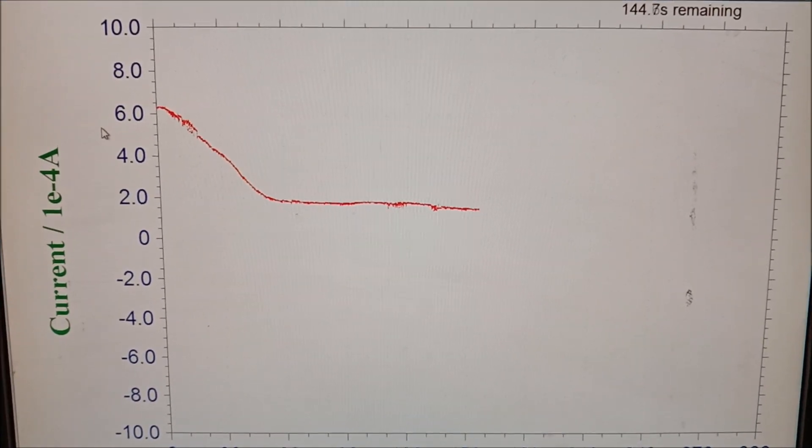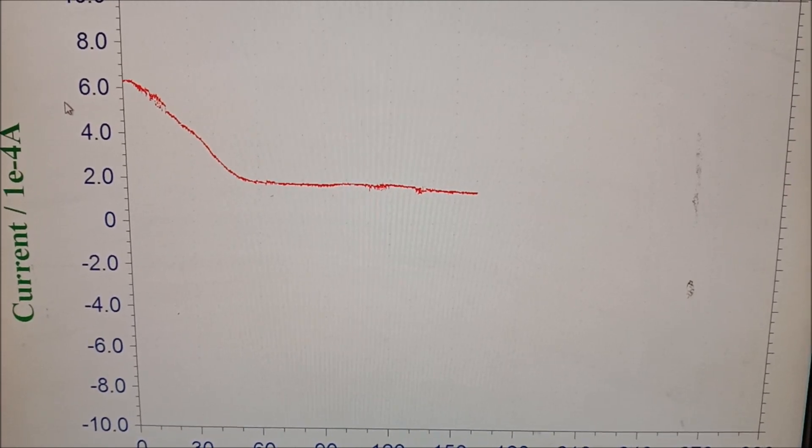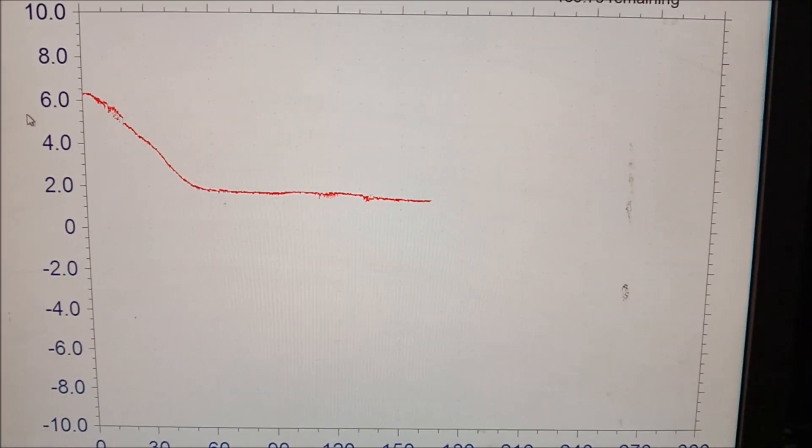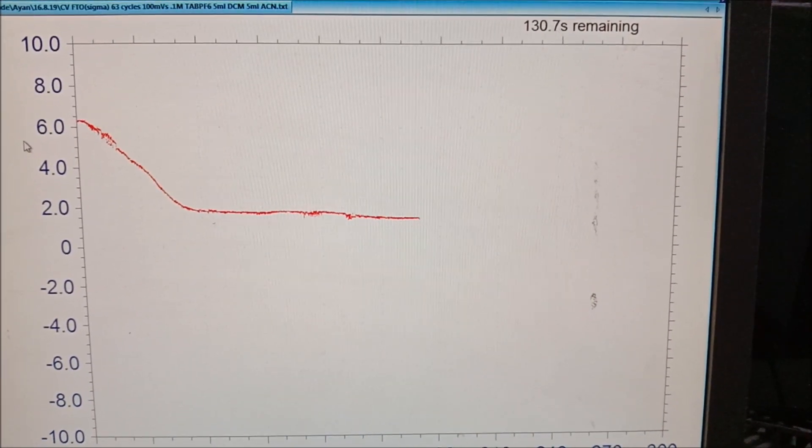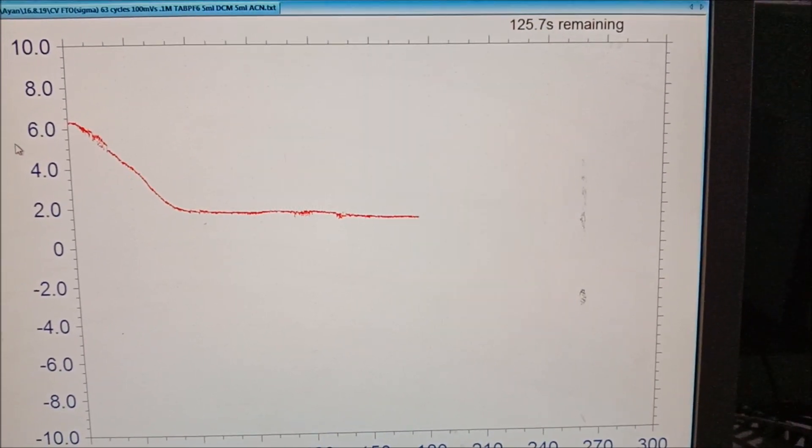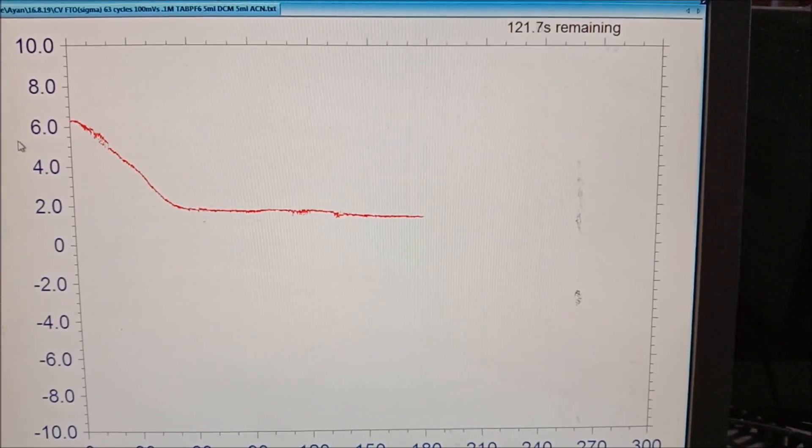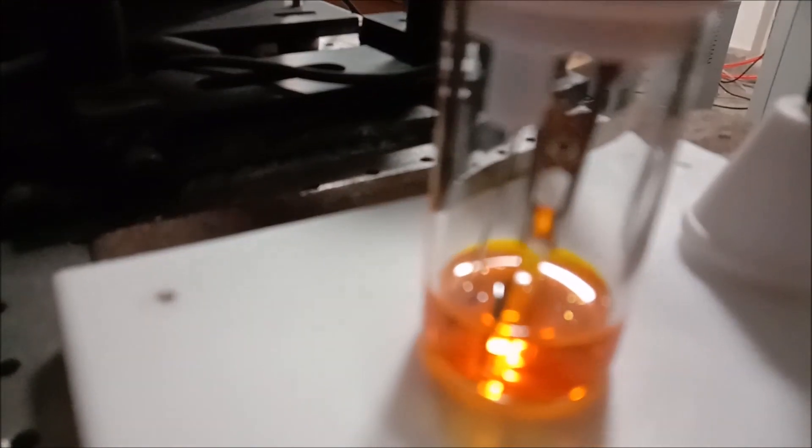I think we have got the optimal thickness in the first process. I have given five minutes for deposition but I think it is quite high. Actually I should have used less amount of time because it is a fast process which has happened so quickly, you can see.